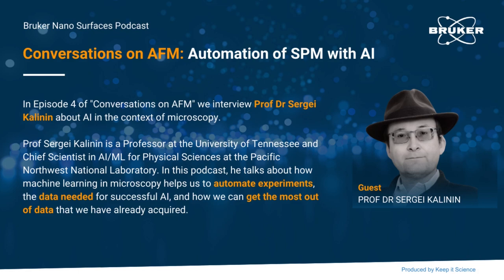And I guess it's also because there are so many different types of microscopes and samples and setups that to be able to really feed all of this into an AI, we need much more data, and probably also much more standardized and prepared data. Which also brings me to a question: how do you even start with getting a model trained? So, for example, how would you say to someone listening to this, how could they start to address this question of automating experiments in their lab?